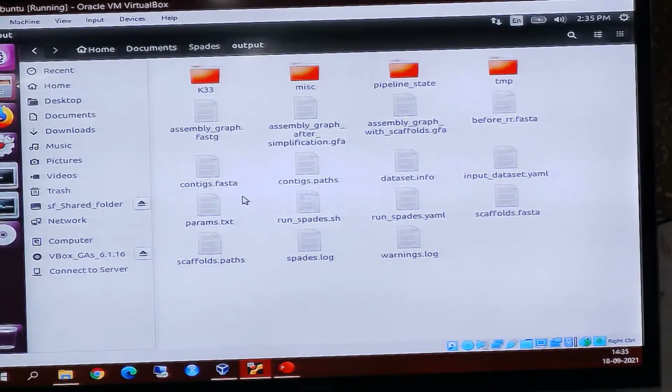They should give everything in the report. What they have done, how they have done this, nothing is given. We have shown per base quality, per sequence quality. Nothing is there. What is this?